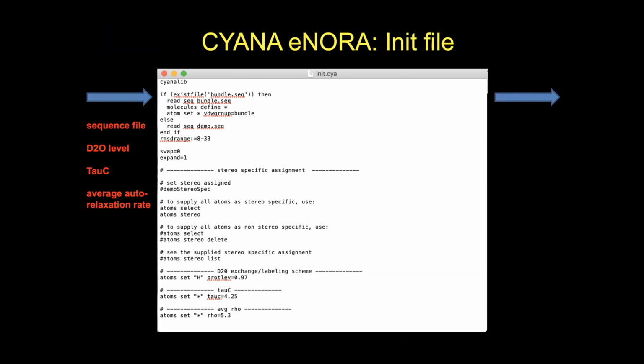Okay, it has been mentioned before that Catalina has some problems with migrating some software. So I'm affected by that too with Cyana. So on this computer, I cannot run Cyana, and as you know, we can't run it on NMRbox either. But Cyana doesn't really have a graphical interface, so it's all text file based. So I'm just stepping through these files.